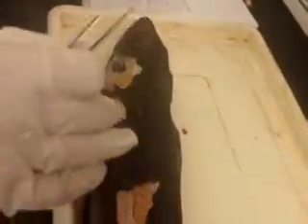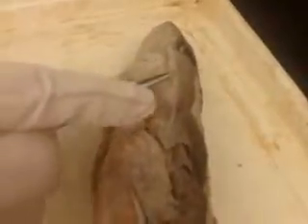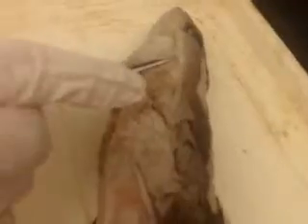Then we have the adductor mandibulae, which is homologous to the adductor mandibulae anterior and externus in the necturus, and it attaches to Meckel's cartilage. You can see it right here. The adductor mandibulae originates in the palatoquadrate and inserts into Meckel's cartilage, and it is homologous to the adductor mandibulae in necturus.